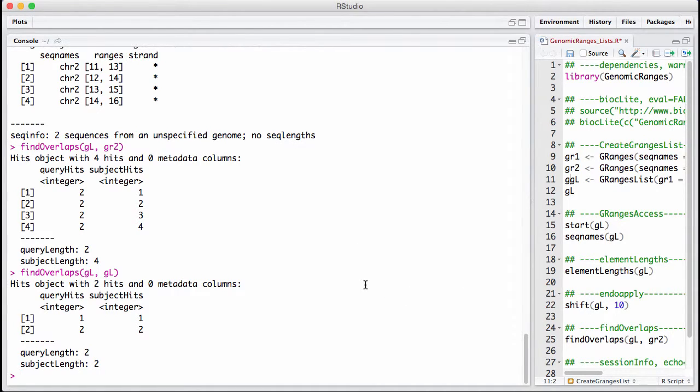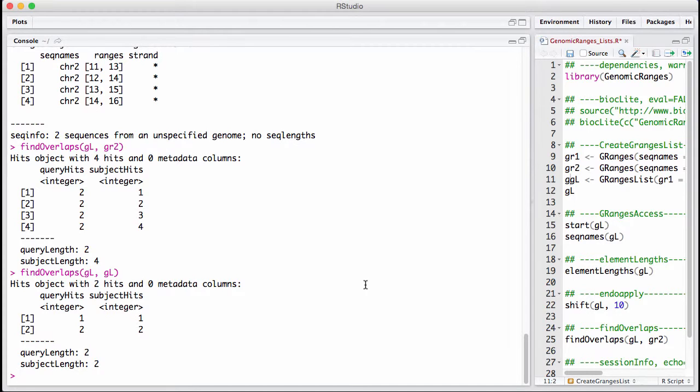This is also usually what you want to do if you want to, say, overlap a transcript with a ChipSeq peak or a read. We are not necessarily interested in exactly which exon overlaps. We just want to know, does some part of the exons overlap a given genomic region?